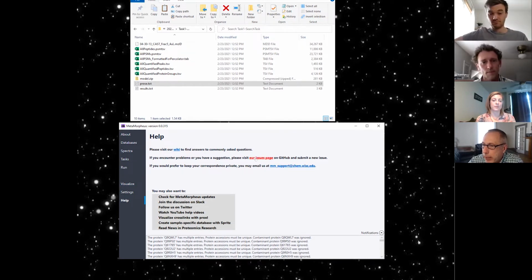There's a link here to the issues on GitHub. In case people don't know what issues are, it's a place where you can report on GitHub that you're having trouble with some feature of the software and it's not working for you. You can open an issue and say, I tried to do a calibration and it didn't work for me, and we'll see that right away. It pops up in our notifications. There's also an email here, MetaMorpheus support. People can email us directly and we'll get back pretty fast.